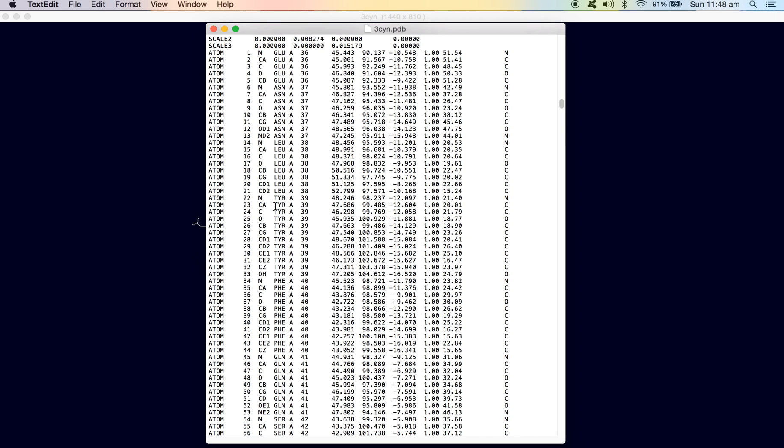By looking at the PDB file, we have been able to identify the position of the amino acid which we want to alter. Now, if you are working with protein ligand complexes and you have already analyzed the interaction sites, then those analysis will guide you towards the selection of the residue which you might be interested to change. But for this demonstration, we will be concentrating upon tyrosine at position 39 of chain A.